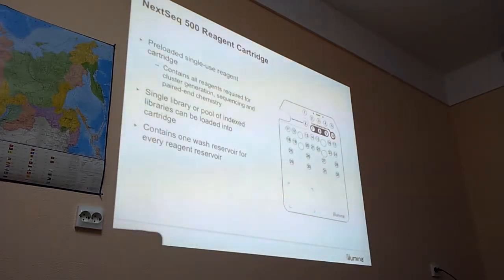They asked if it is not possible to separate it so that they can put it in a different special waste. Formamide is hazardous; all the other reagents are pretty harmless. So now we did this in this cartridge. After using it, you can separate reaction number 6, the formamide, and put it in a separate container. Don't drink it.